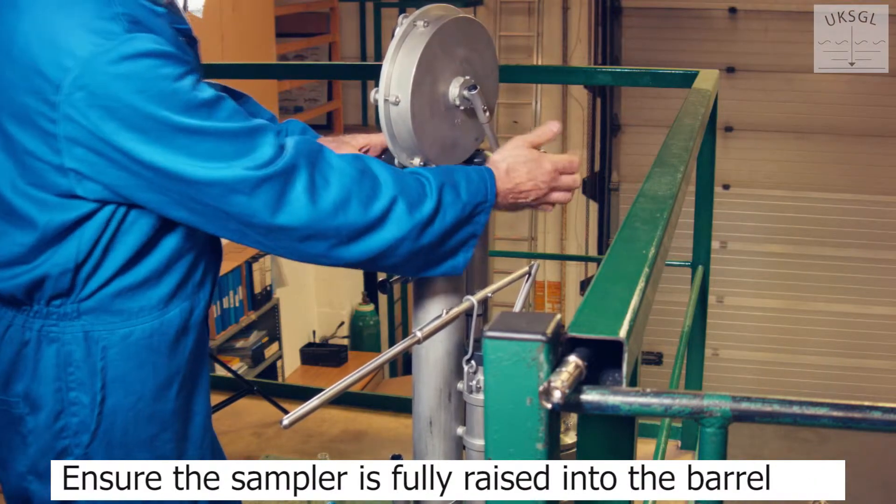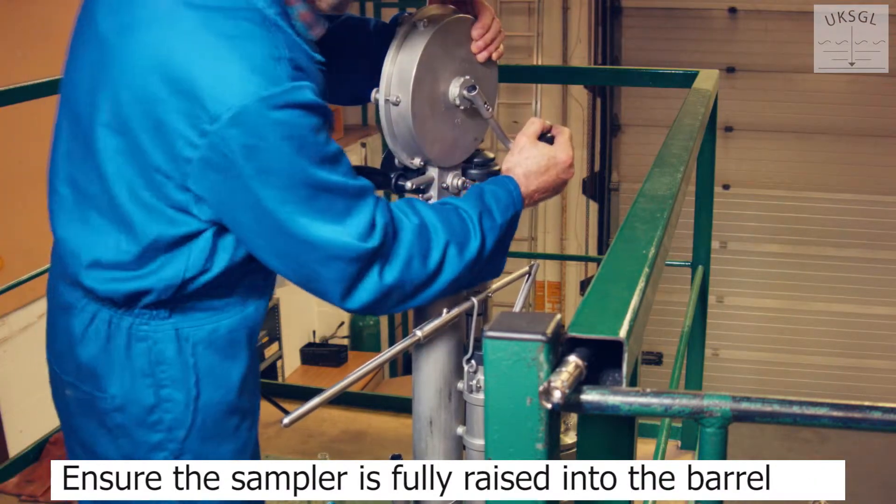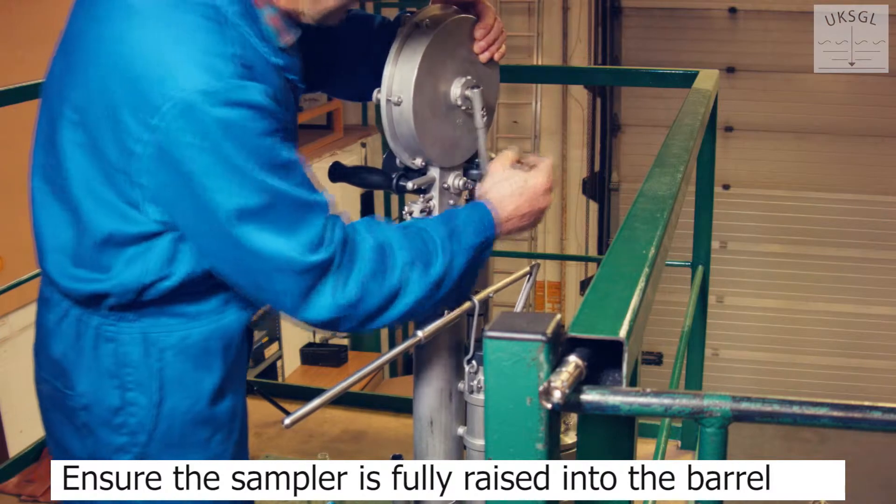Ensure the sampler is fully raised into the barrel. Otherwise, it will not be possible to drain the liquid.